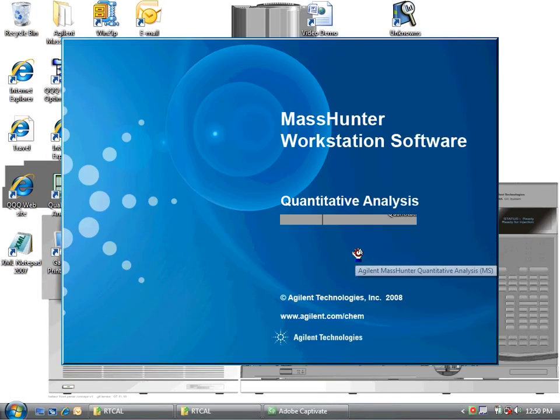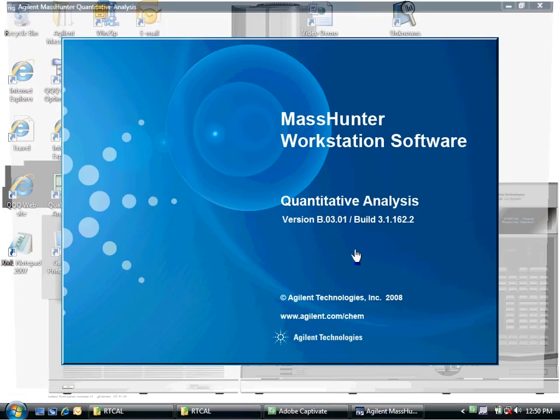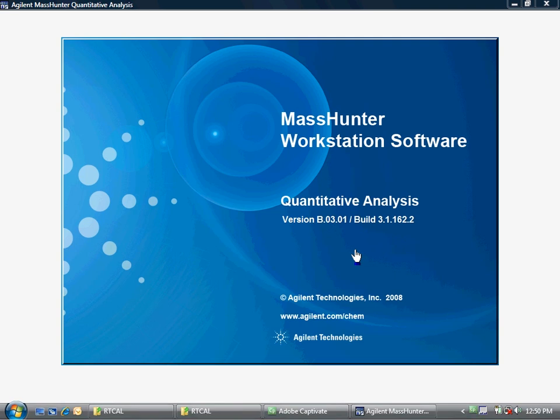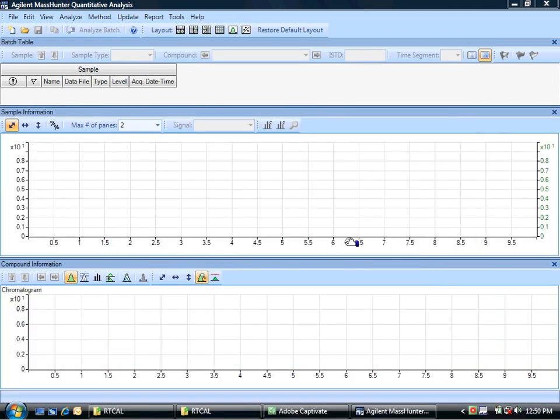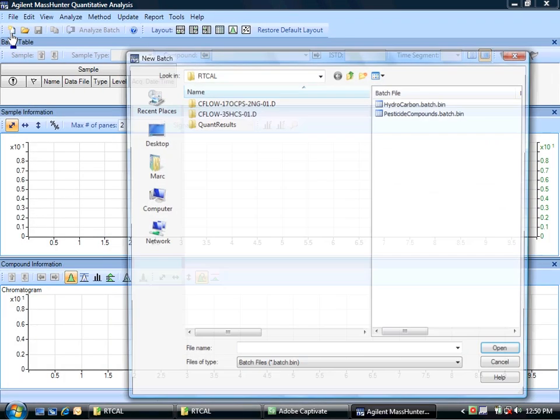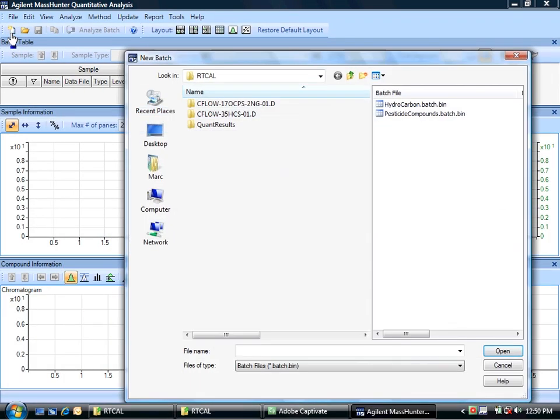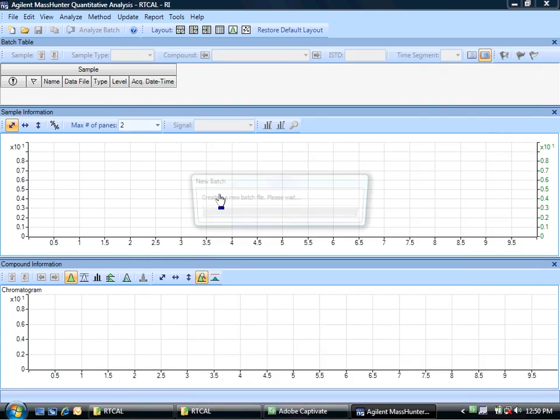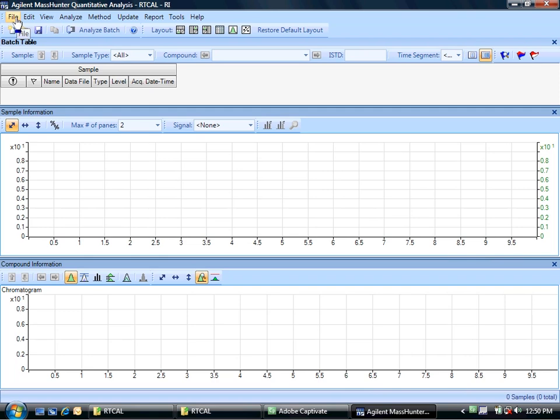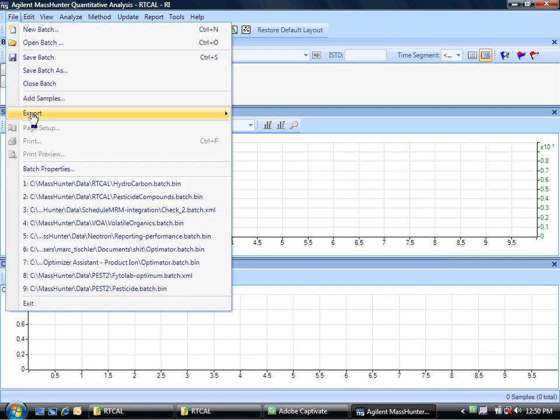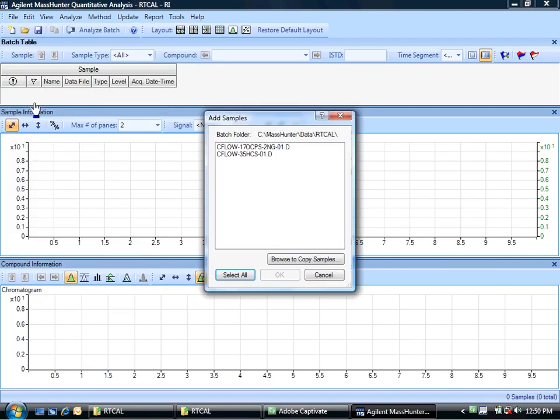Alright, I have collected a data file with the hydrocarbon series in it, so next I'm going to have to create a quantitation batch. I can quickly do that by creating a new batch. I will just call it RI.